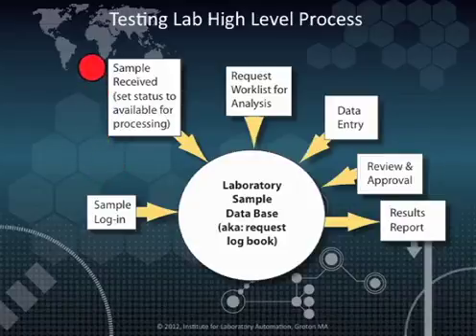It's possible for work to be logged into the laboratory before the samples arrive so that people know what is expected. When the samples come in, its arrival is noted, and the system is aware that this material can now be processed. The database is also used to develop work lists for analysis.